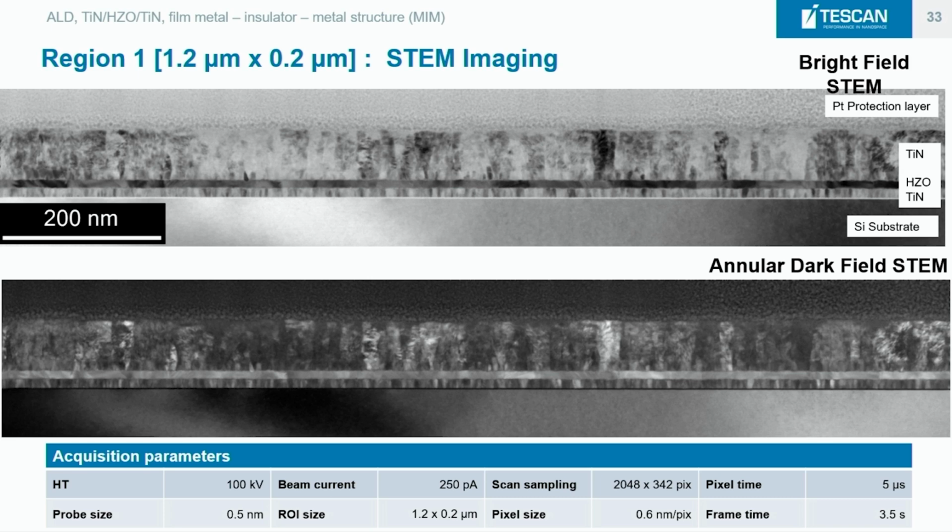We can actually do this type of work with the 4D-STEM up to 30 microns. So we have very good beam tilt purity out at the end. I believe it's called purity, beam tilt. And so we have very large regions. Instead of having to stitch things together, we can get it all in one go.